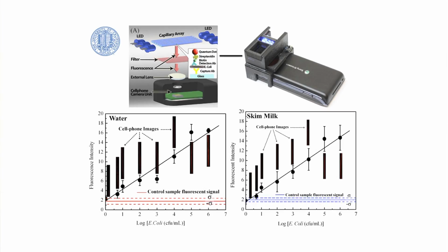I've talked about different designs and different ways that you can use the cell phone itself as a means for performing high-end microscopy to the level where you can routinely see single viruses that are attached to a surface, or using the cell phone itself as a fluorescent imager.